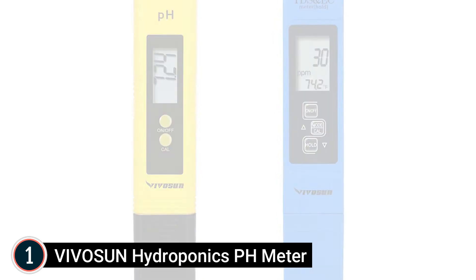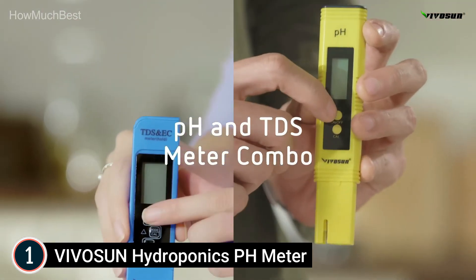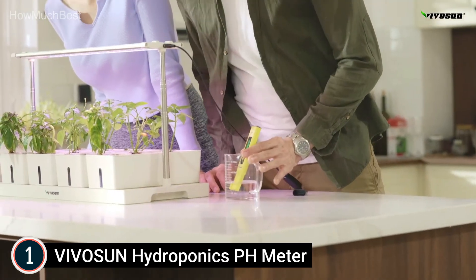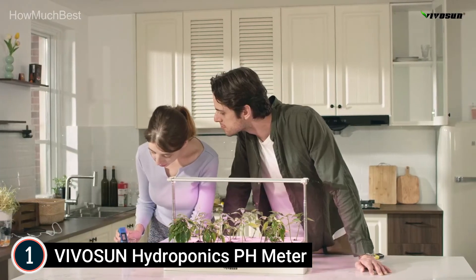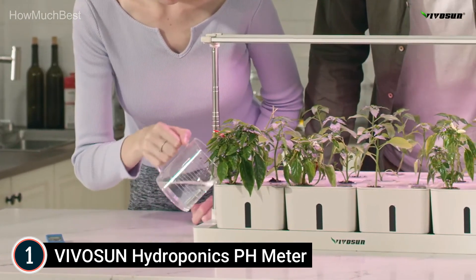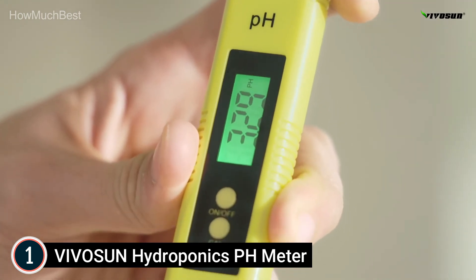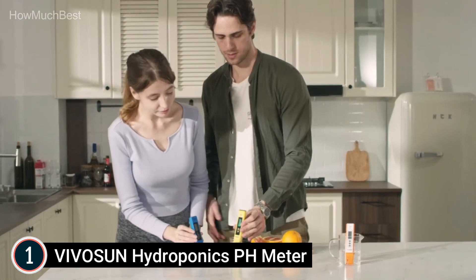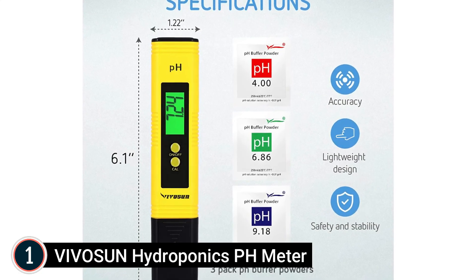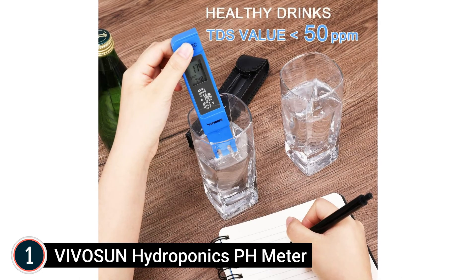Application — great for all home and lab TDS and pH testing applications including aquariums and swimming pools. pH meter with a full measurement range of pH 0 to 14, providing reliable and quick readings. 3-in-1 TDS meter with measurement range of 0–9990 ppm, 0–9990 µS/cm, accuracy plus or minus 2%, and temperature range of 0.1 to 80.0°C (32.0 to 176.0°F). Note: this meter cannot test seawater. Features a protective safety case, lightweight and portable design for convenience.